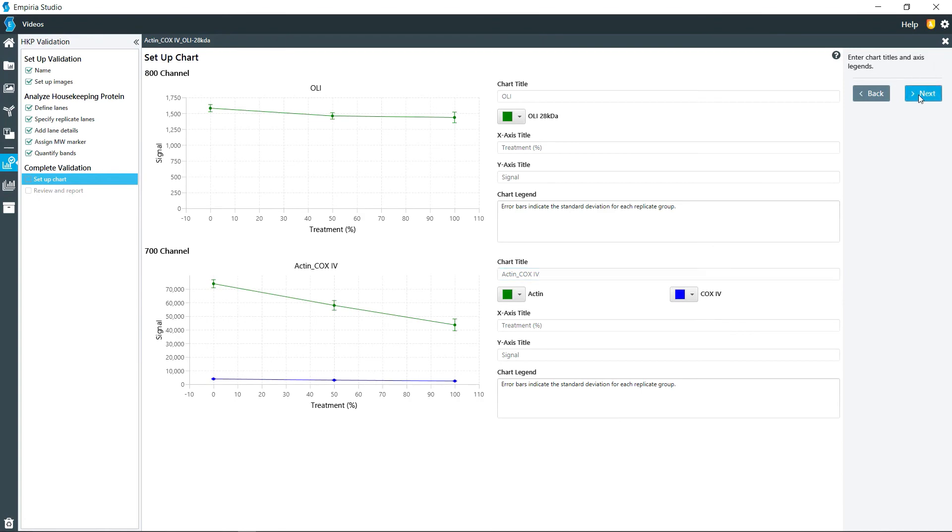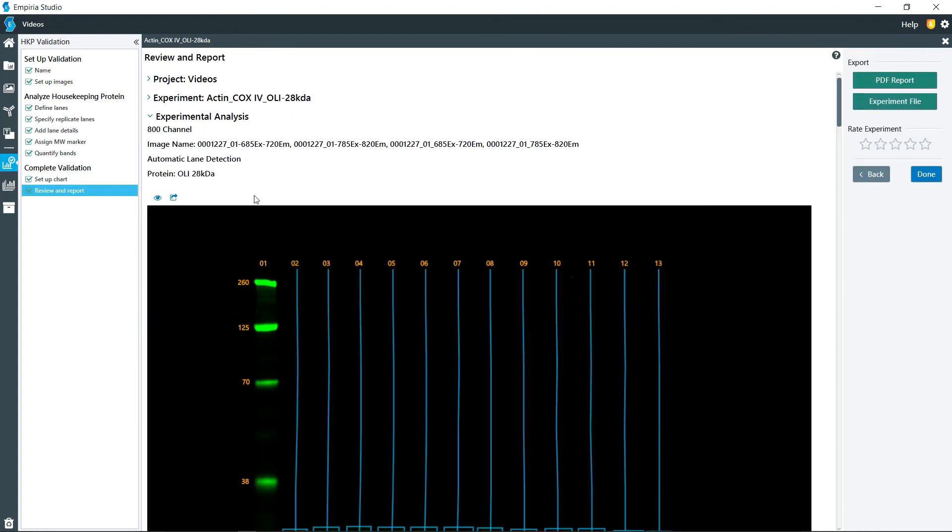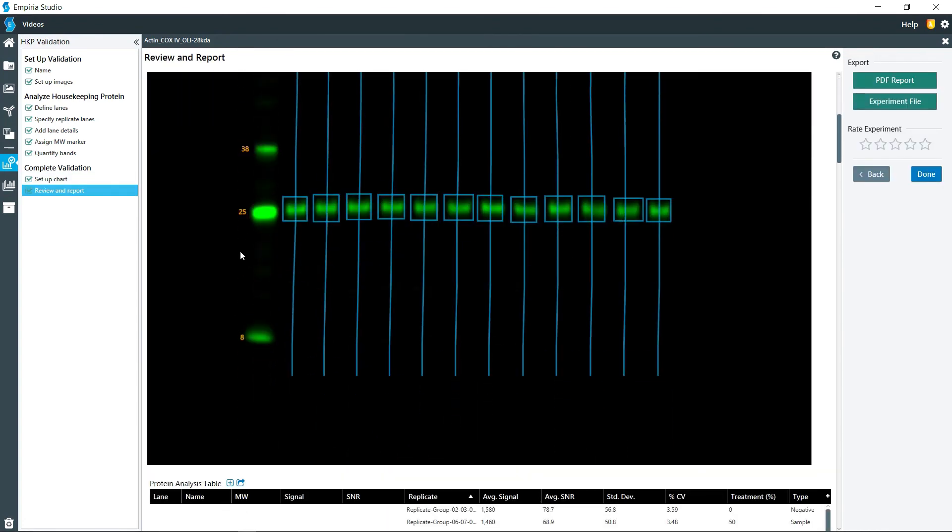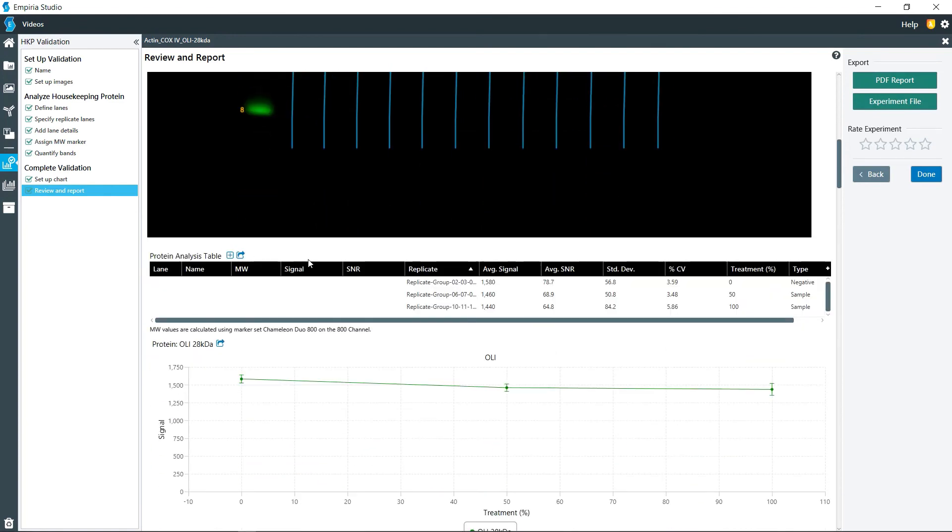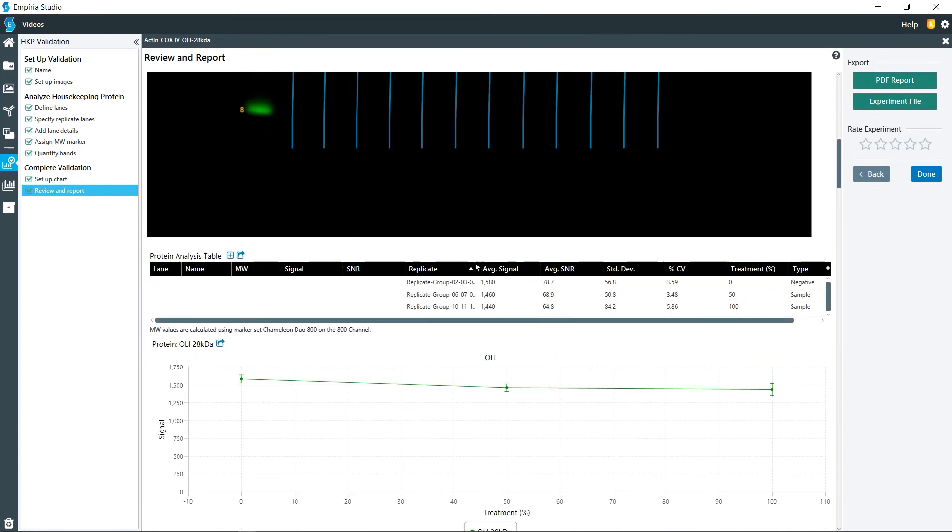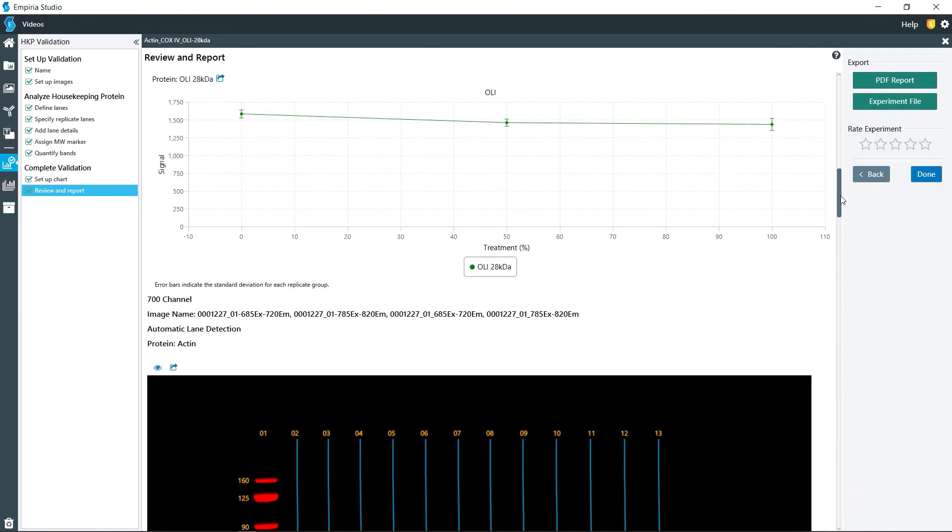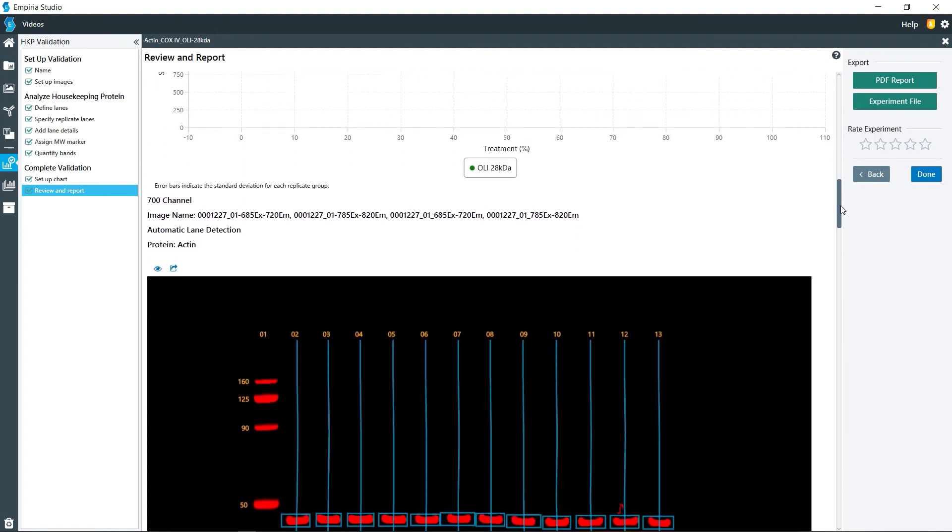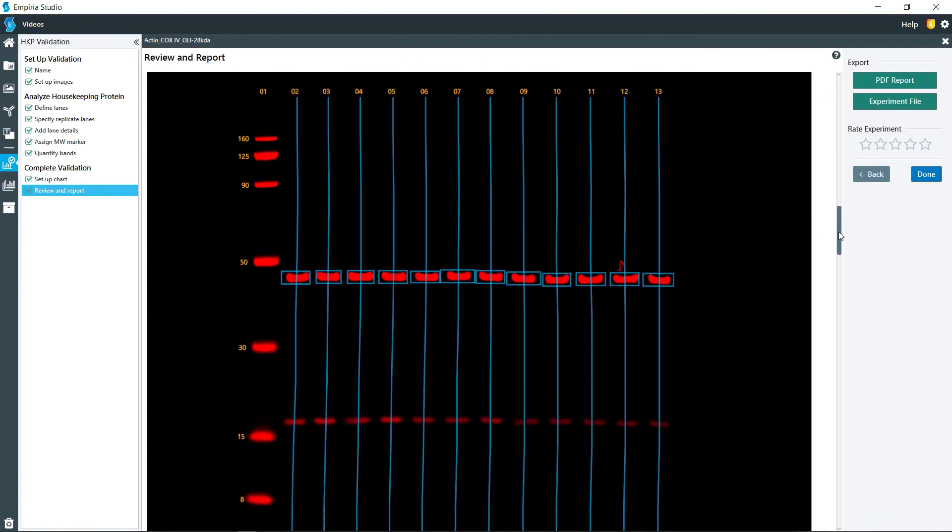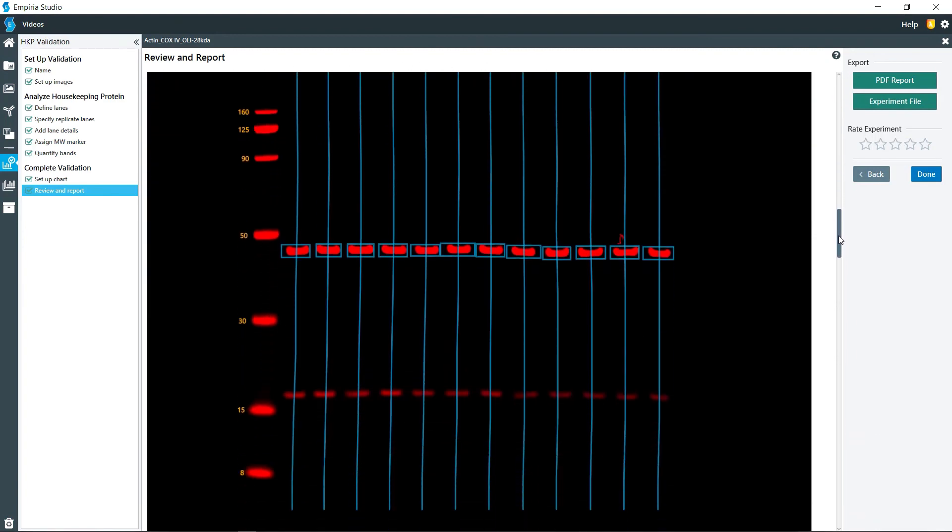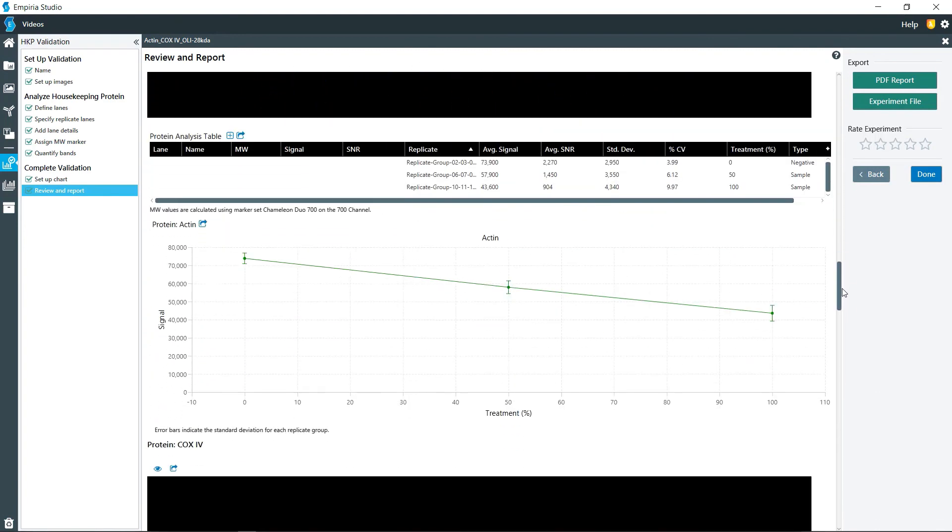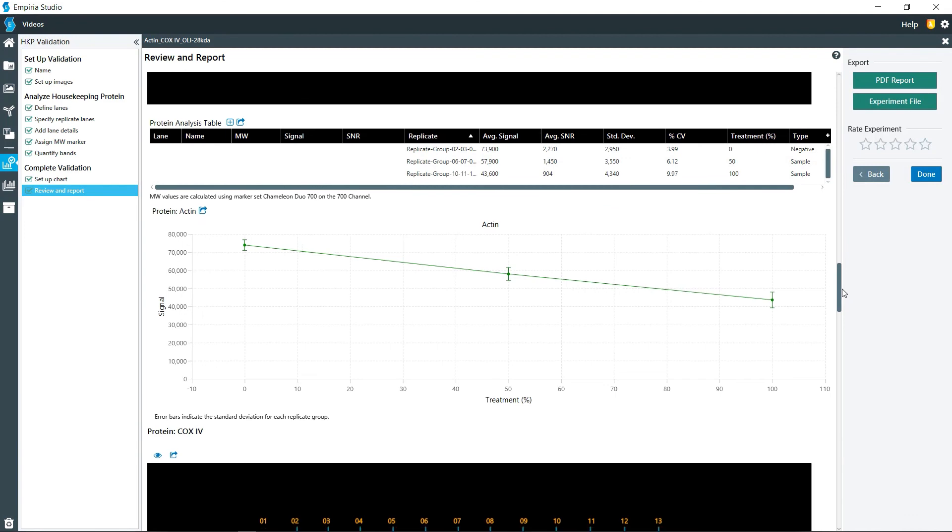And then if you click on next, it takes you to the review and reports. So it gives you the images and then all of the quantification data on here. Now since we did have replicates, it will average them together and give you standard deviations and CV values on here. And as we continue to scroll down, it gives you the charts and then images for each one of the proteins that was quantified.